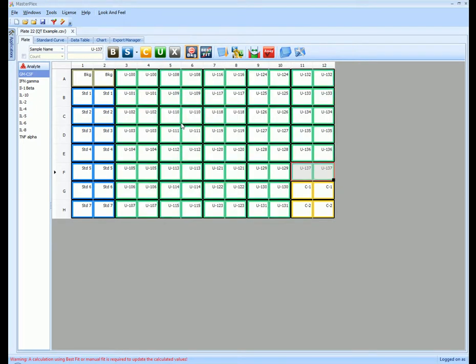And this will work for any starting replicate shape. You don't have to have side by side. You can have stacked or triplicate or quadruple, etc. It's a little time-saving feature that not everybody can intuitively pick up. So I'm just going to toggle the replicate group name now.